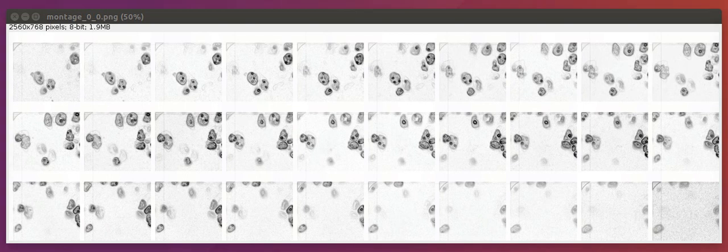Hi everybody, this is David again with some instructions for doing single cell image segmentation. So continuing from the previous video, what I'd like to do in this video is provide some examples of how you should use the three-dimensional context to segment cells that are next to each other.